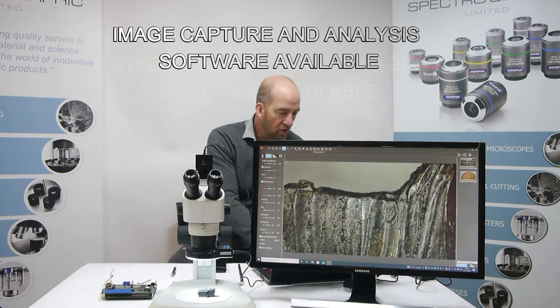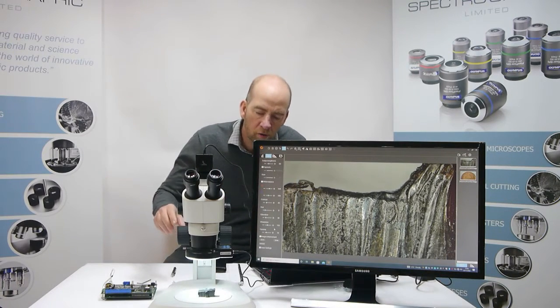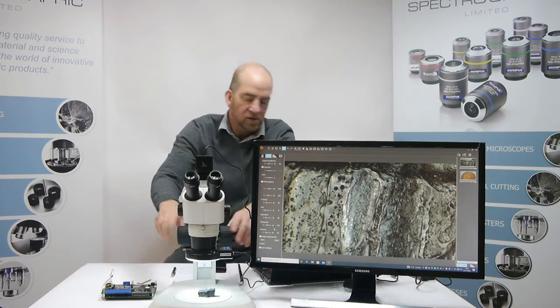So within the software, I can make changes to the image. Get it more punchy, what we like to see. Show the features that we want to show. And of course, again, I can zoom into this sample.